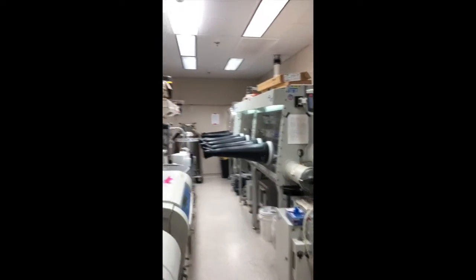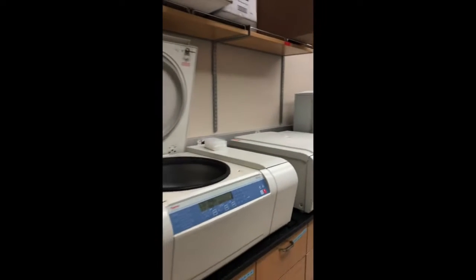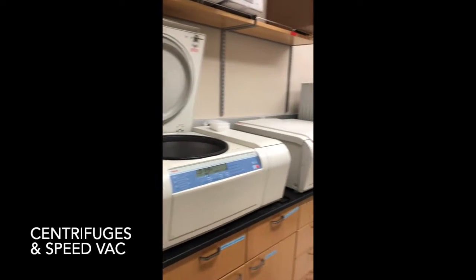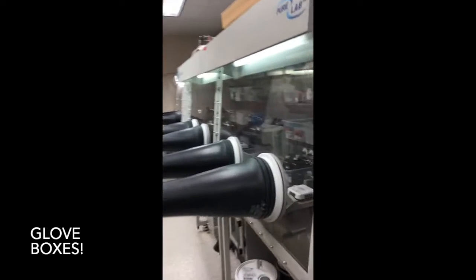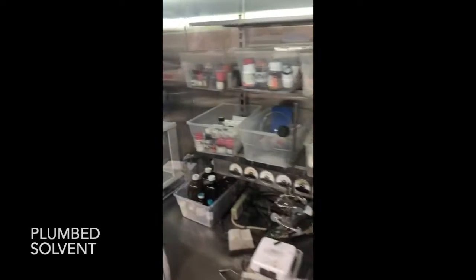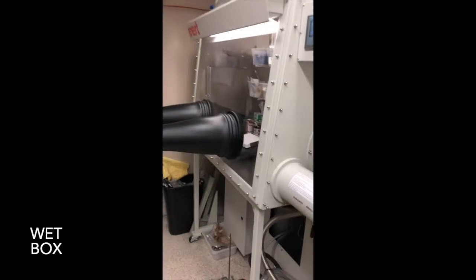Solvent purification is here. Opposite that we have our large centrifuges for handling cell cultures. There's a speed vac for removing solvents and then of course our glove boxes. Here we have some plumbed solvent balance, all the sorts of things one typically finds in a glove box for organometallic chemistry.